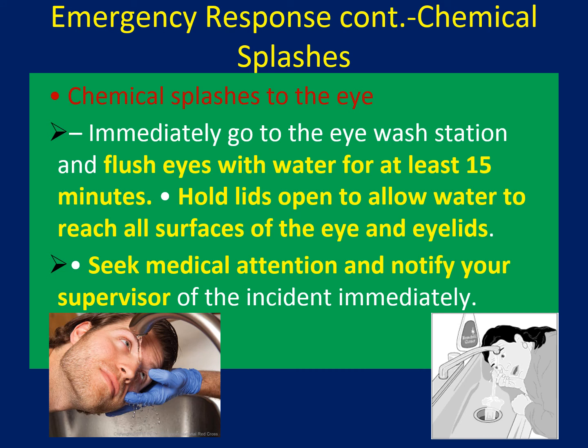In case of chemical splashes into your eye, right? So many chemicals are toxic, and if it splashes in your eye, you have to wash. You have to go to the eye wash stations and flush your eye with water for at least 15 minutes. Hold your lid open to allow the water to reach all surfaces of your eye and eyelids.